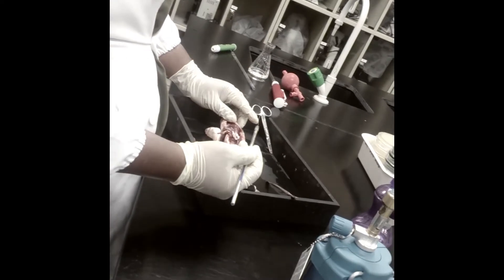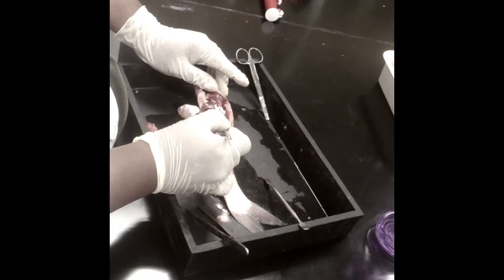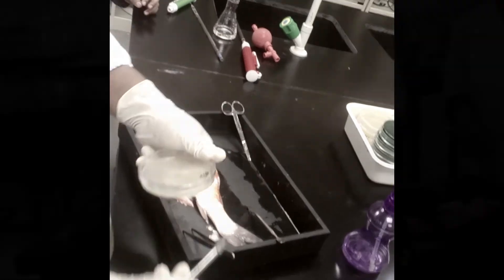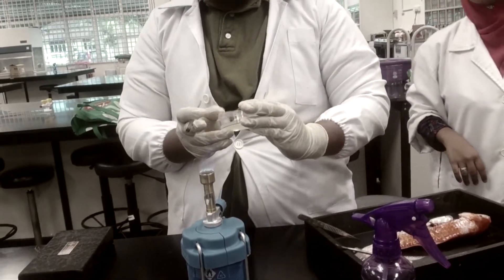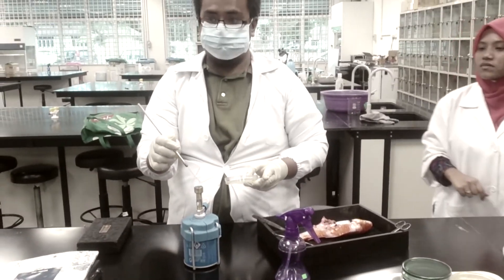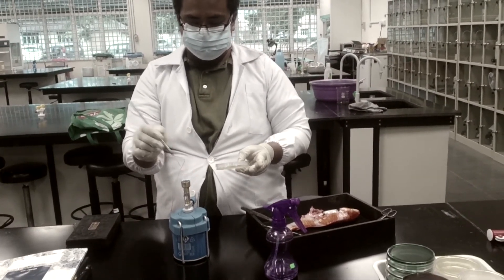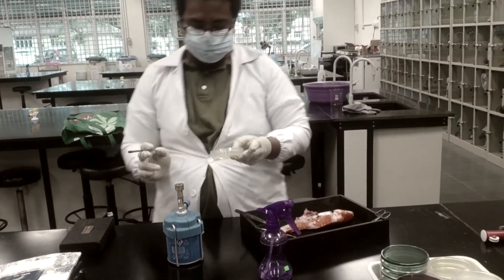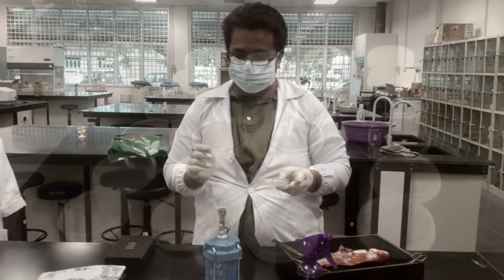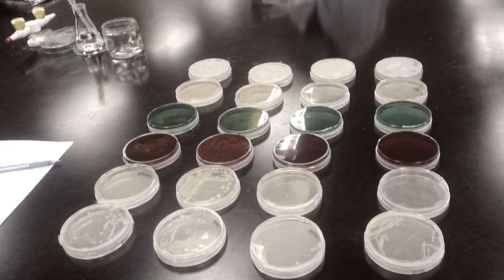And then we streak the bacteria isolate onto the media that we have prepared. We streak the bacteria into four quadrants. For every quadrant we streak, we must sterilize the loop. We seal and then incubate for 48 hours.